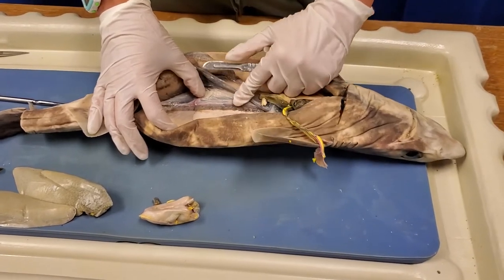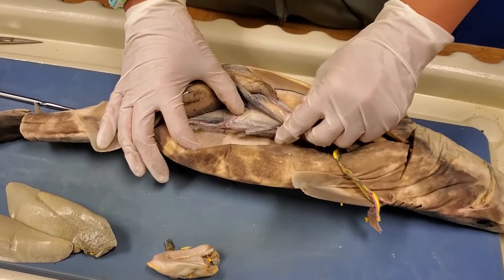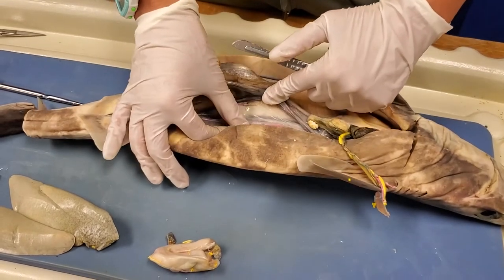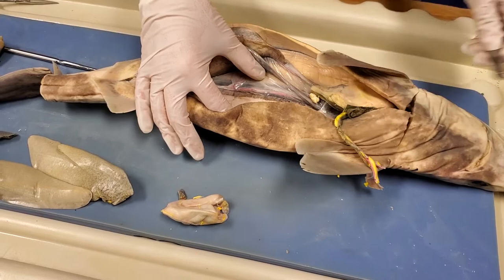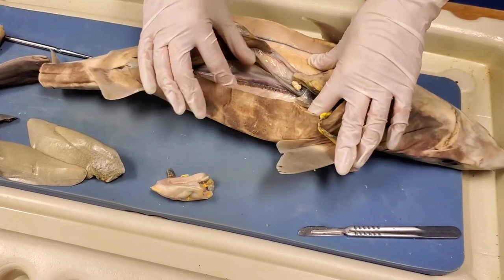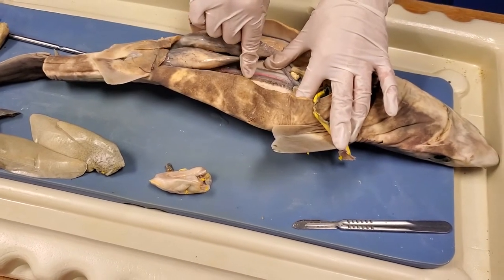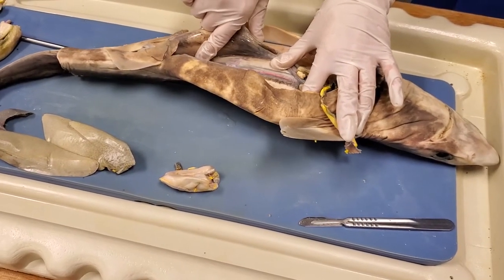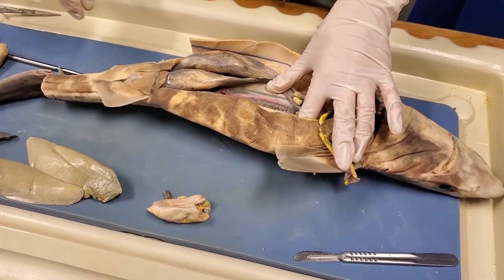Another feature worth noting is the kidneys. You can't really see them clearly, especially in a female shark — it's a little bit darker. The kidneys in a shark are not a little bean-shaped organ the way they are in a person or most mammals. You can see all the way along that dark tube — that's part of the kidneys. It's just a big long tube that runs all the way down the shark.